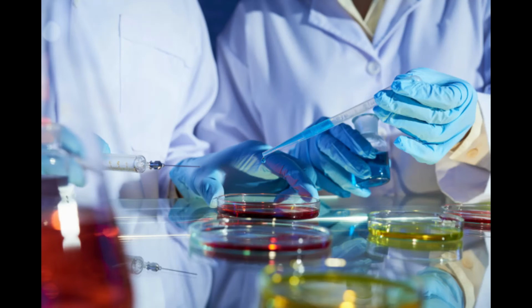Okay. Now the other one is, look on page 45. Page 45 actually has a picture of Serratia marcescens growing on plates. So y'all can get a visual on what that looks like. See how red it is? So it's real easy to pick out if that's the one that you have, because most things don't do that. But that's Serratia growing. Now, the streak plate is our last one.